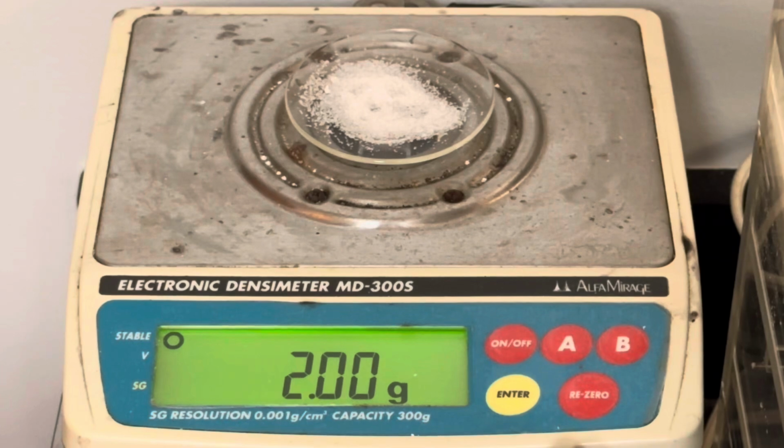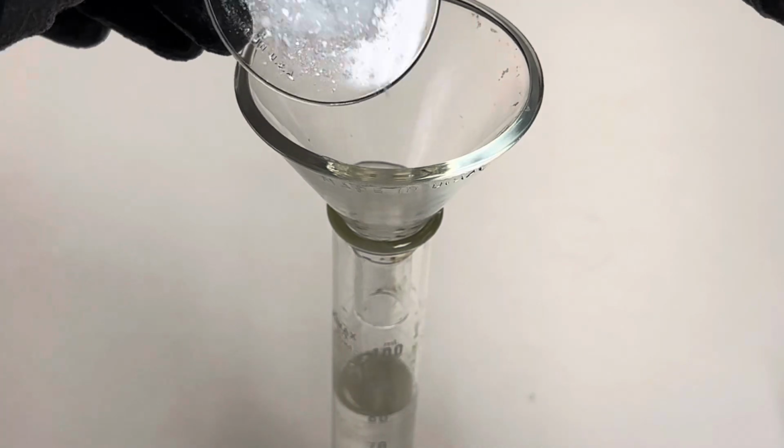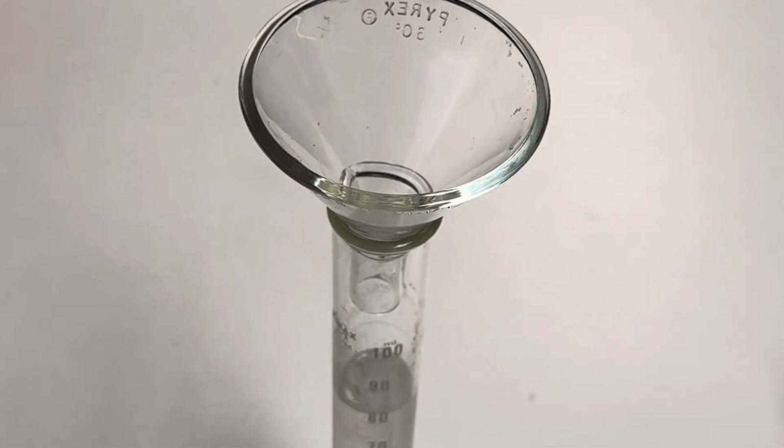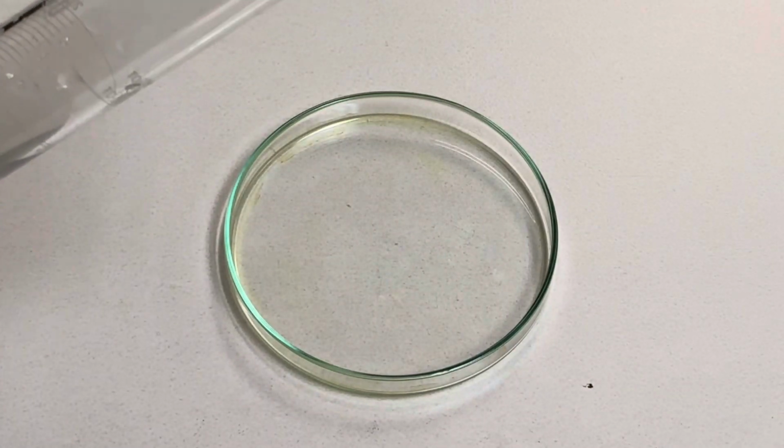Begin by measuring out 2 grams of barium chloride. Next, add your 2 grams of barium chloride to 80 milliliters of distilled water and stir the solution until it's aqueous. Once the solution is aqueous, add some of it to a petri dish.